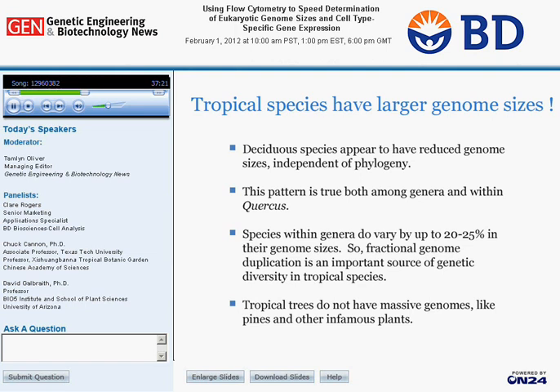And one thing that was an assumption was that tropical tree species have relatively small genomes, but again, you don't know that until you really prove it. And so we found that, yes, it's true that tropical trees don't have massive genomes like pines or other infamous plants like Trillium. So this is good news for further genomic studies. And so we are now confident to move on to begin to sequence a lot of these species.